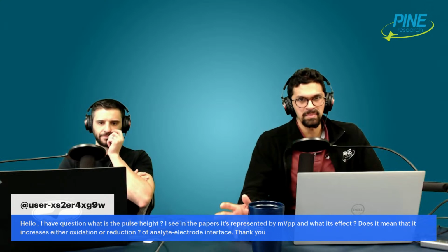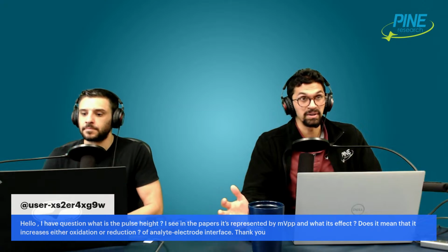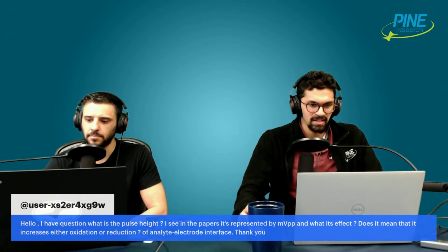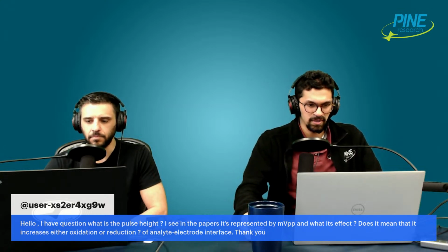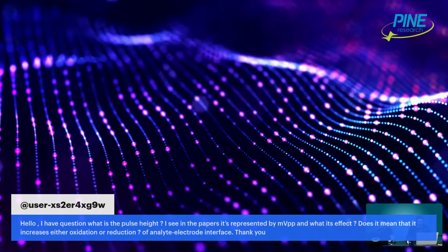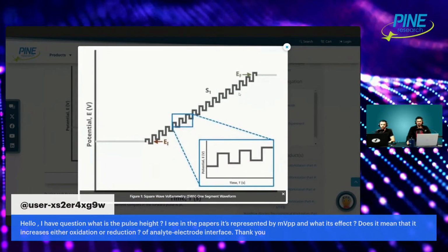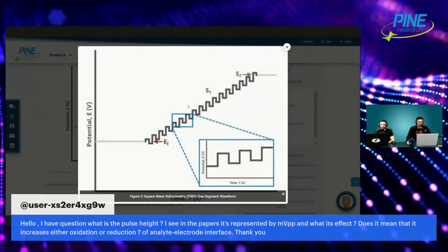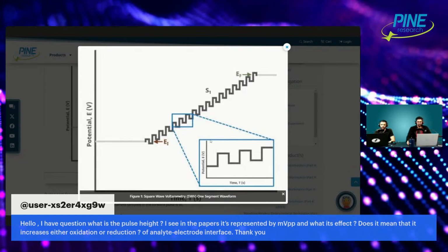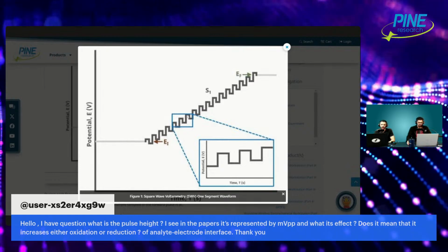Now, I'm still learning a lot about square wave voltammetry and the math behind it. It's somewhat convoluted because they always present things as dimensionless. But the neat thing about square wave, and I'm going to hopefully be able to share, is that this is the one reason why it's hard to talk about this: you have to actually draw it, and I can't type out what this peak means. Is my mouse showing up? Okay, it is. It's a little hard to see, but anyway, we can see it.